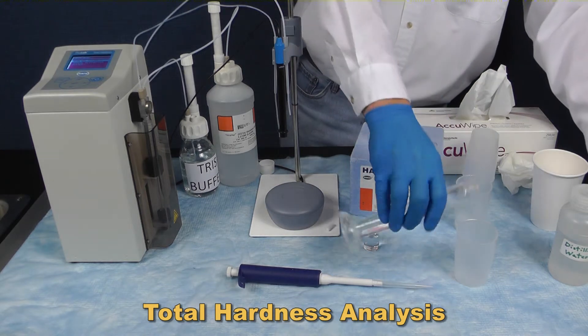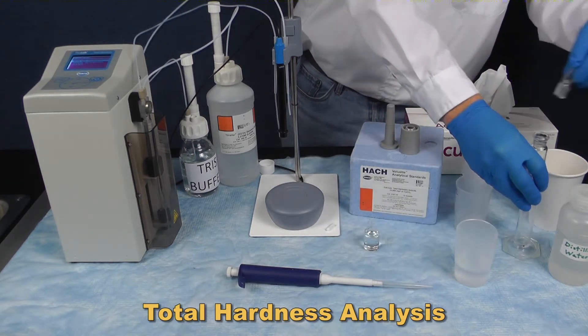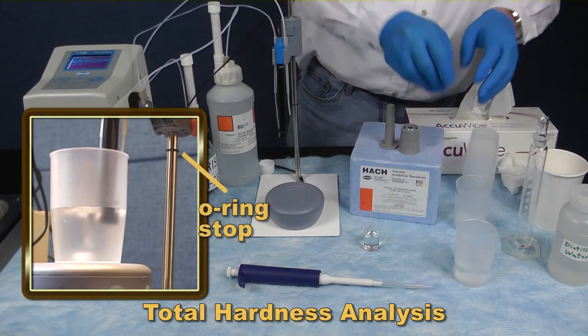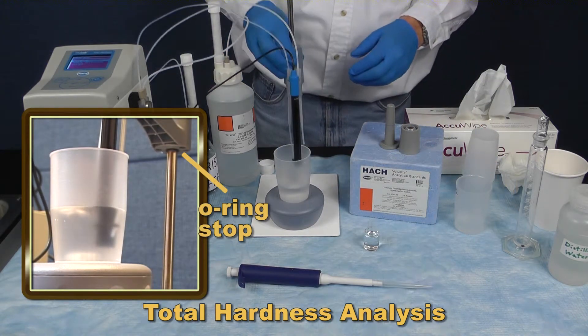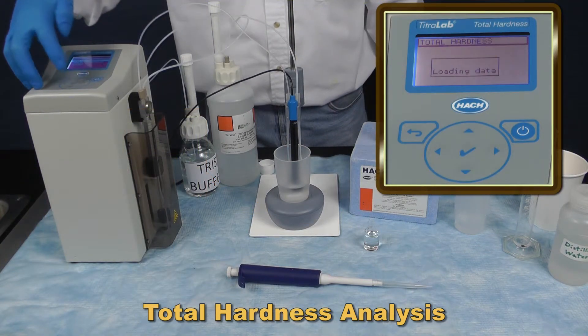Place a stir bar into the standard. Place the sample onto the stir stand and lower the electrode into the solution. On the screen, select Analyze Hardness, Start Analysis.